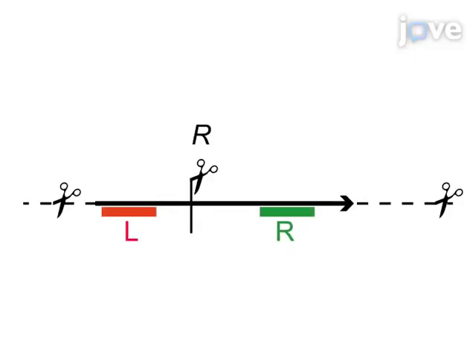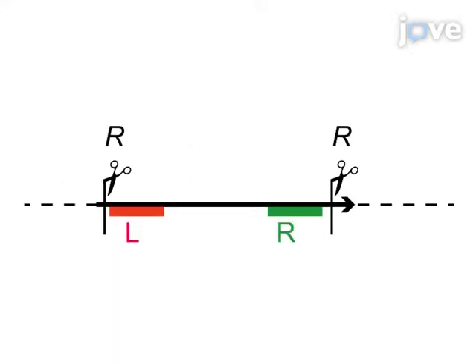Select an enzyme that cuts once in the middle of the tDNA to be able to independently probe sequences upstream and downstream of the restriction site. Also, select an enzyme or combination of enzymes cutting out the entire sequence of interest at once. Take care to use only restriction enzymes that are not sensitive to cytosine methylation.